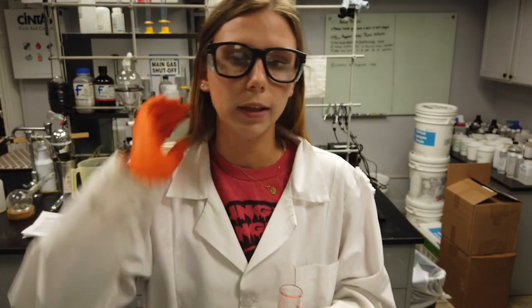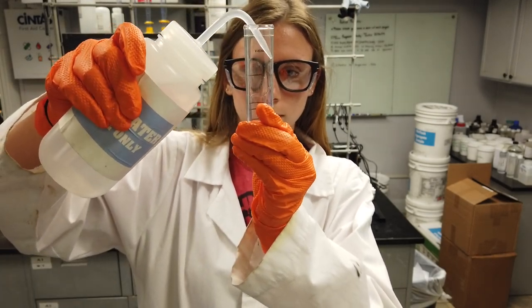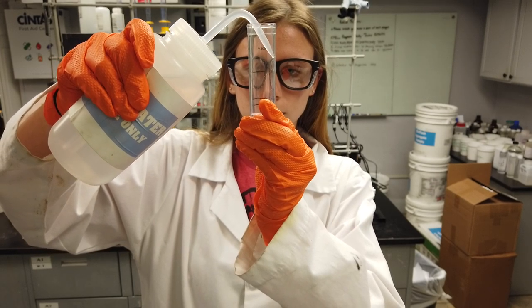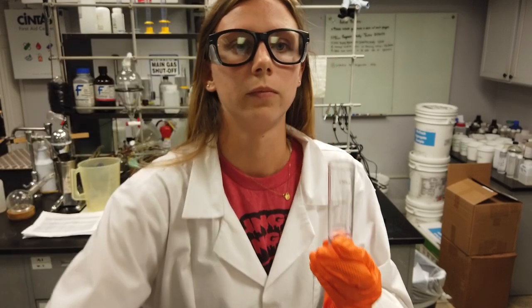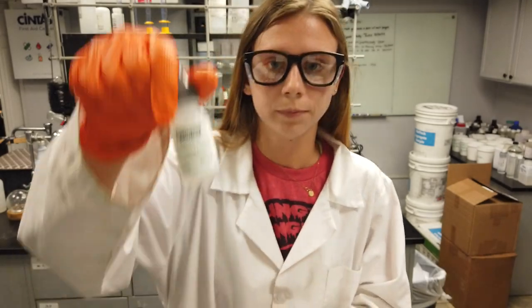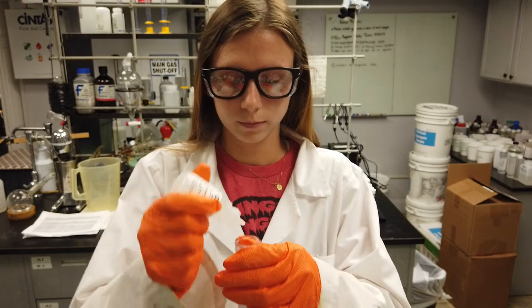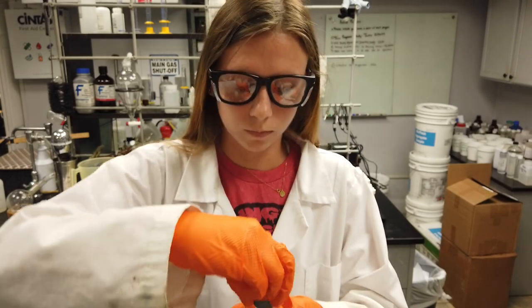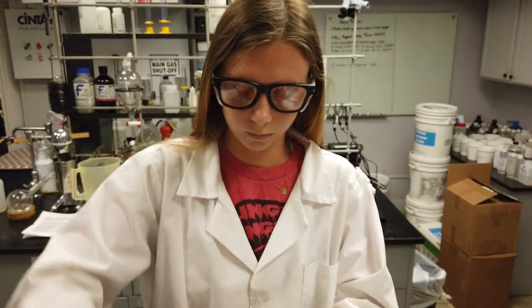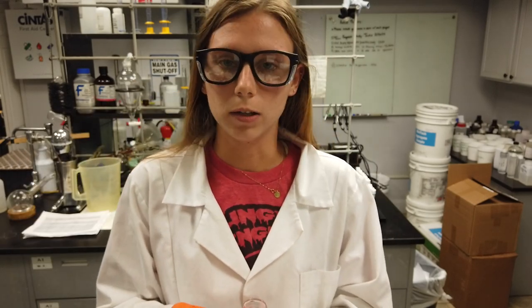Then fill the vial to the 10 mL mark with tap water. Add 2 drops of complexing reagent and swirl to mix. Then add 3 drops of phenothaline indicator and swirl to mix.